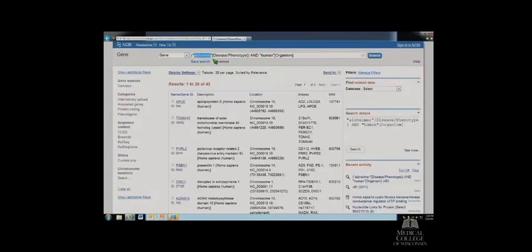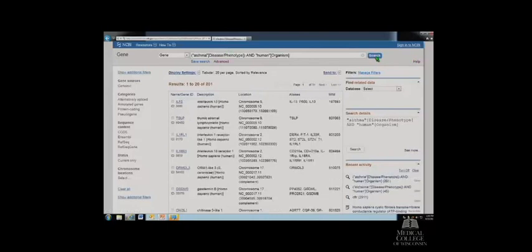Just to quickly demonstrate, now that I have that correct field code, I know how to spell asthma. So I'll just change that to show that it's kind of interesting that asthma, perhaps to be expected, has a lot more genes associated with that particular disease. So that's the way I would have done it. You can just type in asthma and do the search and look at all your genes. But just know that it might be in some other field when you're doing it that way. In this case, I know exactly that asthma is in the disease phenotype field. But if I'm interested in anything that might have any relation to asthma, then I might want to search across all of them. So it's just something to be aware of.